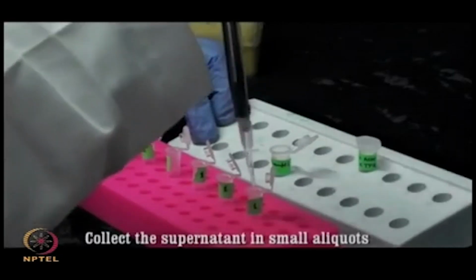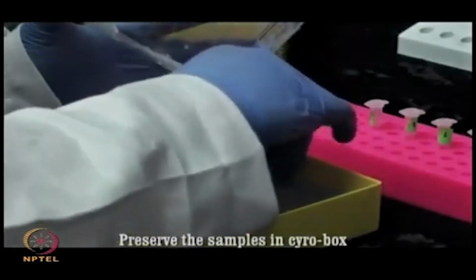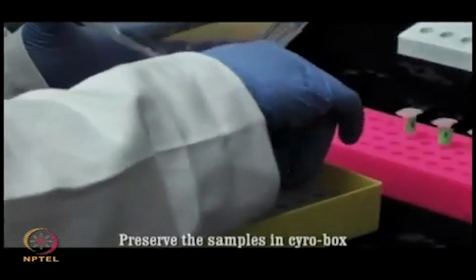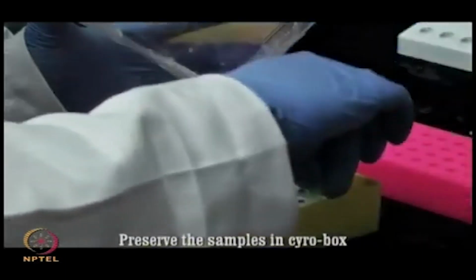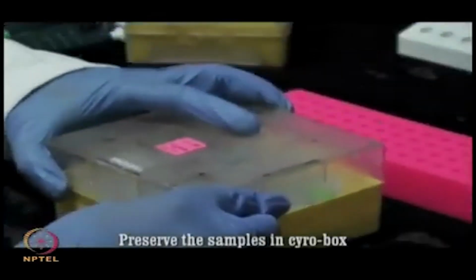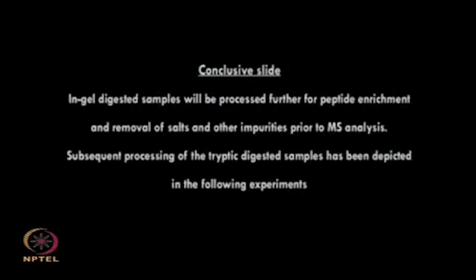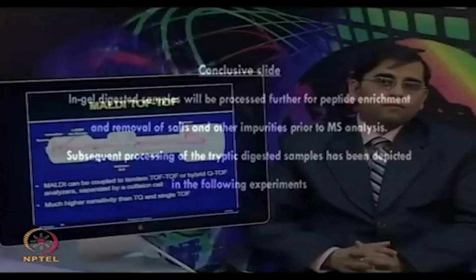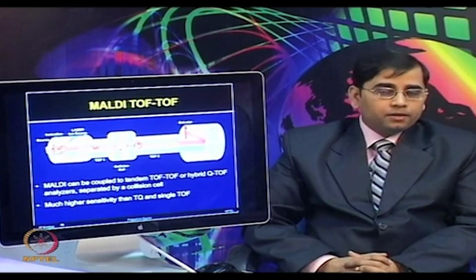All the solution volumes described in the protocol are recommended volumes, but depending upon the experimental requirement, you can optimize and change these volumes and the incubation timing. Now, these samples can be stored and used for further mass spectrometry analysis. So, now you are clear with how to perform the MALDI-TOF experiment.